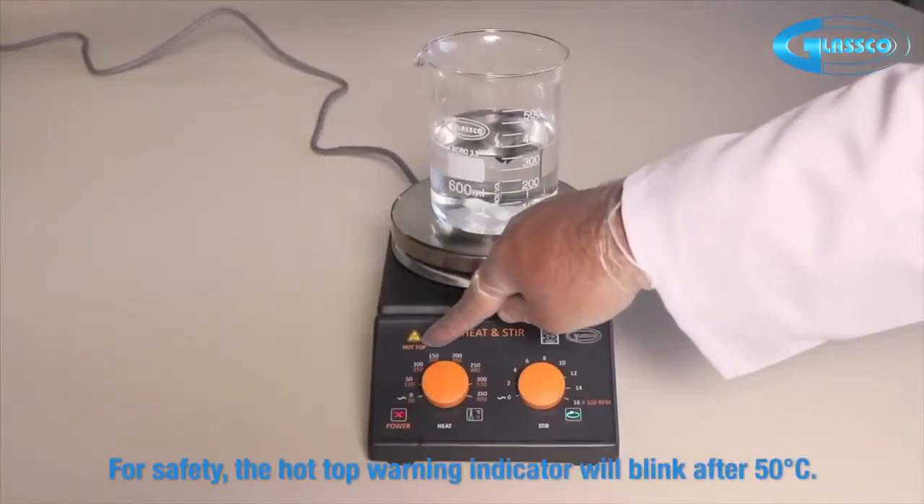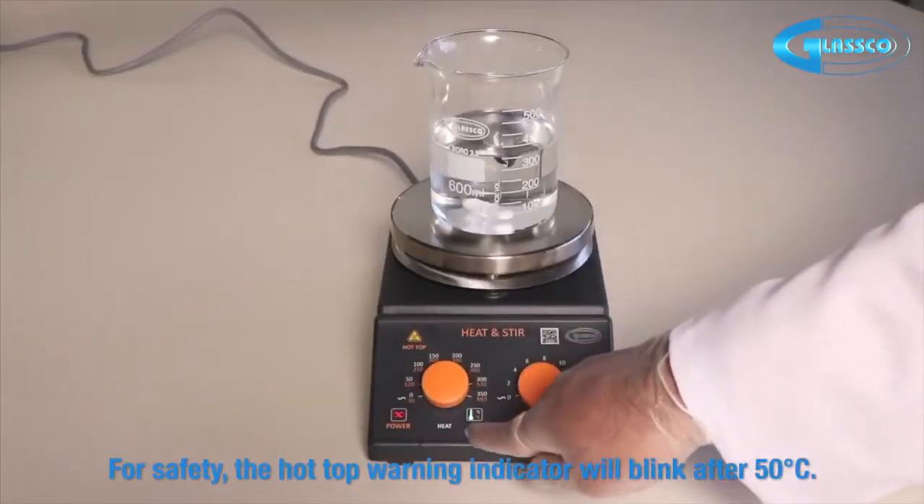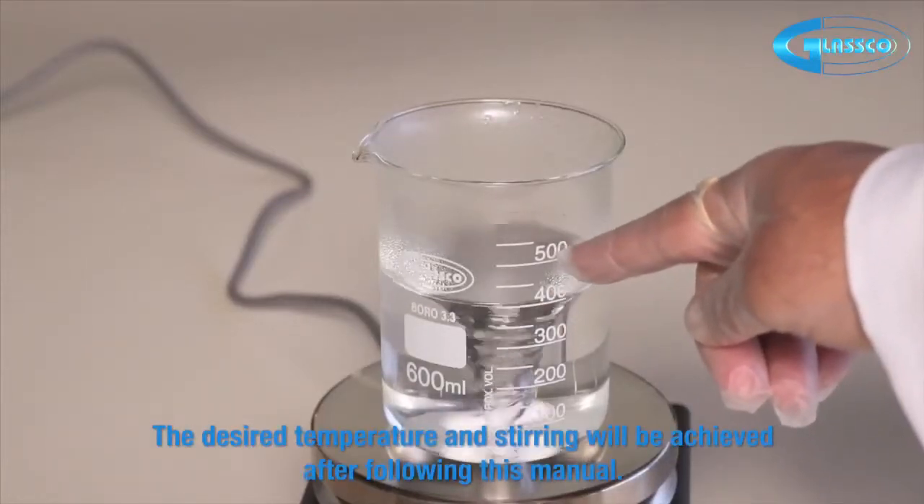For safety, the hot top warning indicator will blink after 50 degrees Celsius. The desired temperature and stirring will be achieved after following this manual.